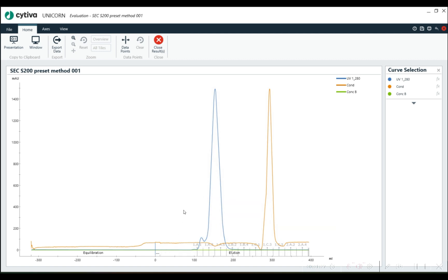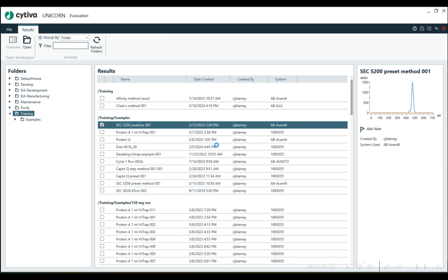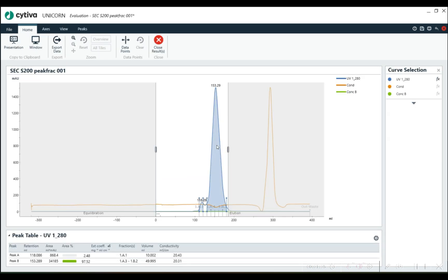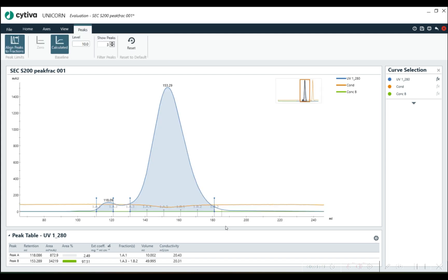There's one way to do this, which is super easy, and it will end up looking something like this result up here. So with this result, I'm just going to zoom in.